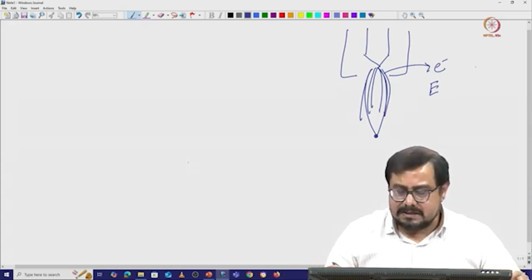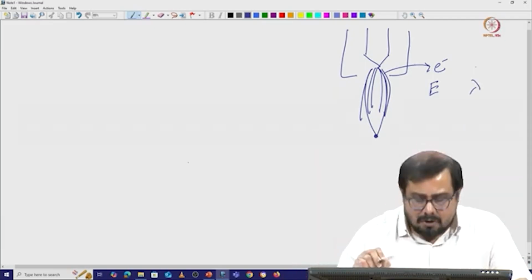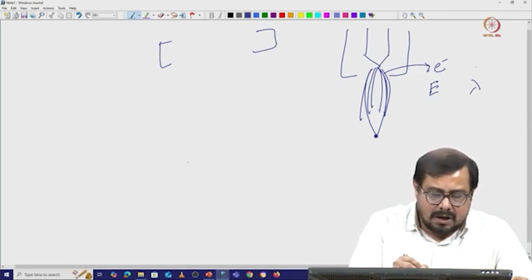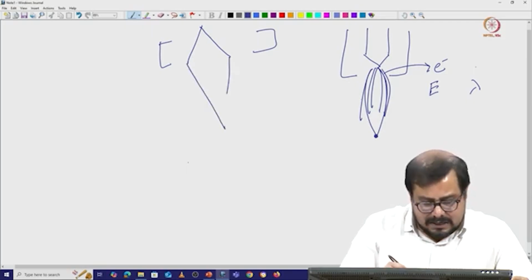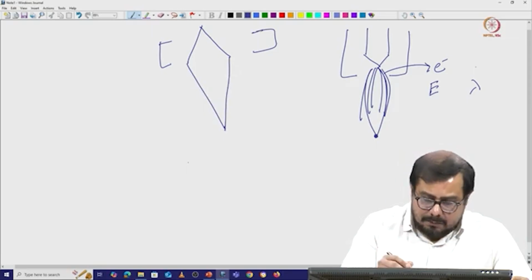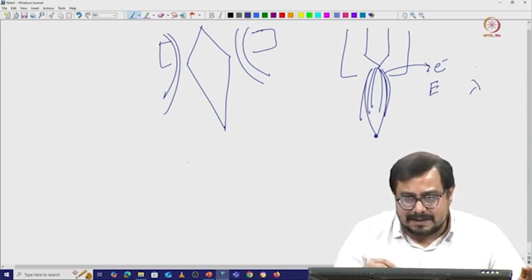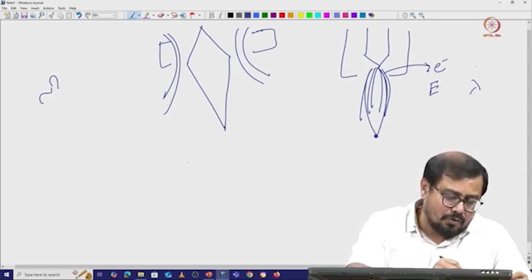But if there is an energy difference, it is going to affect their wavelength also, right? When we have an electromagnetic lens system and an electron beam, we just use a ray diagram and consider that all the rays converge at one particular point, using the same magnetic field at that time. For example, for the objective lens, as I told you, it is around 2 Tesla.